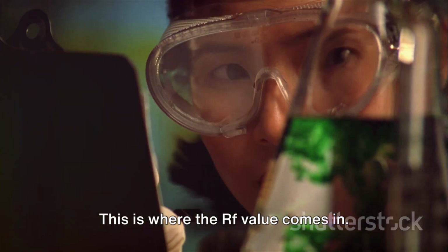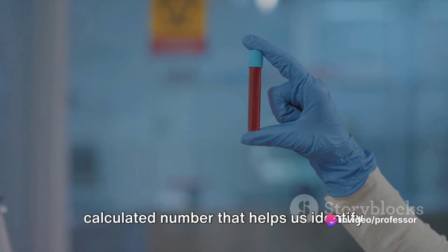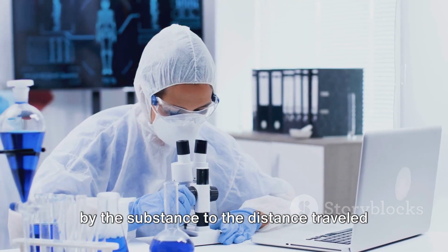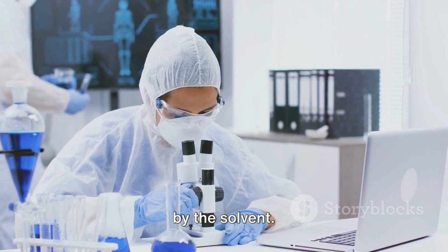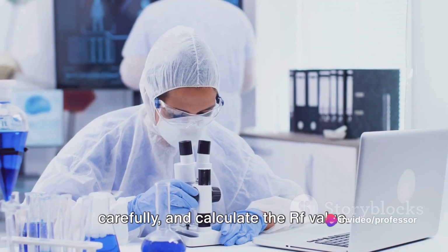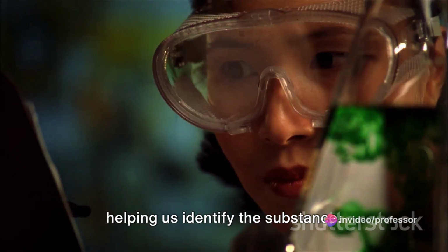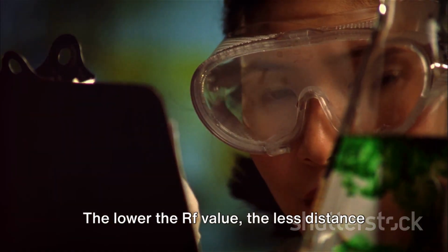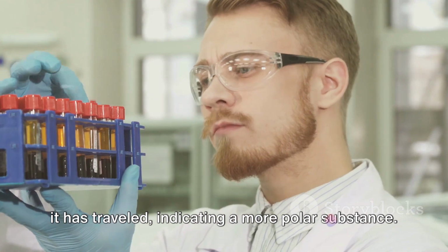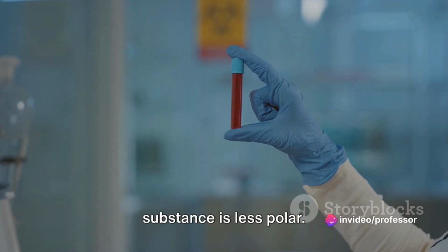This is where the RF value comes in. The retention factor, or RF, is a calculated number that helps us identify each substance. It is the ratio of the distance traveled by the substance to the distance traveled by the solvent. So take a ruler, measure these distances carefully, and calculate the RF value. This unique number is like a fingerprint, helping us identify the substance. The lower the RF value, the less distance it has traveled, indicating a more polar substance. Conversely, a higher RF value means the substance is less polar.